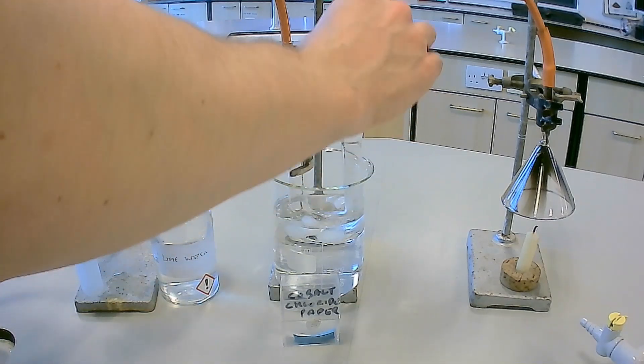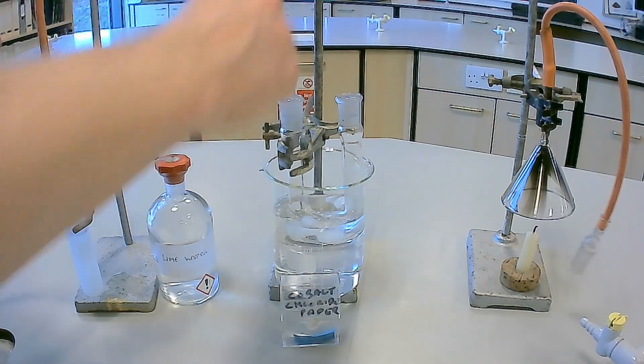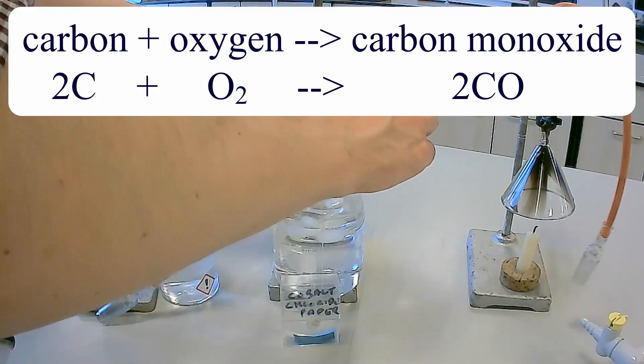Another product of incomplete combustion of carbon containing compounds is carbon monoxide. The equations for the production of carbon monoxide are shown on screen now.